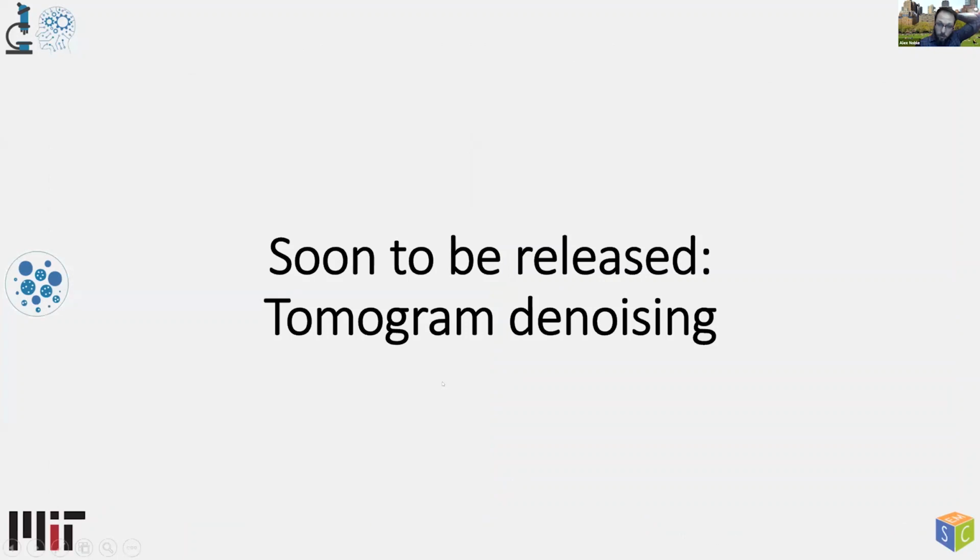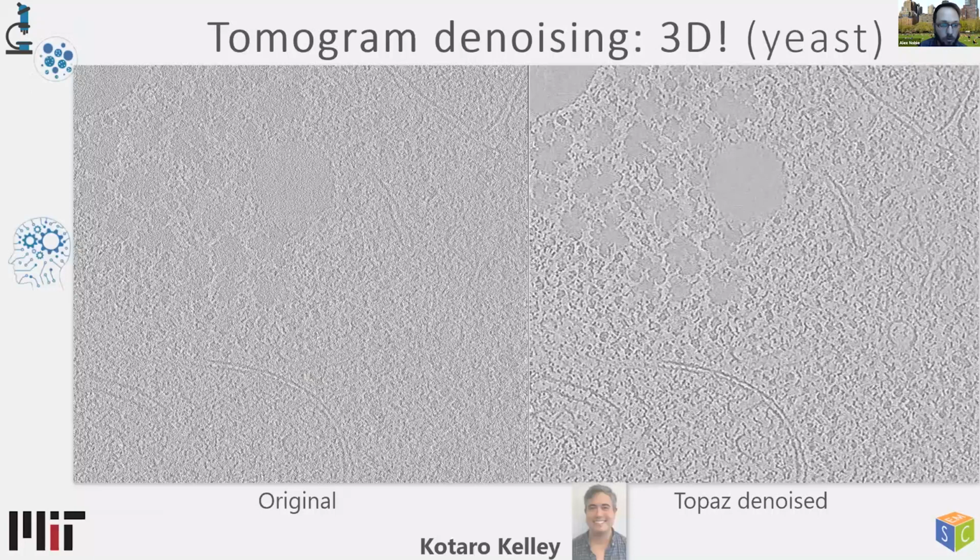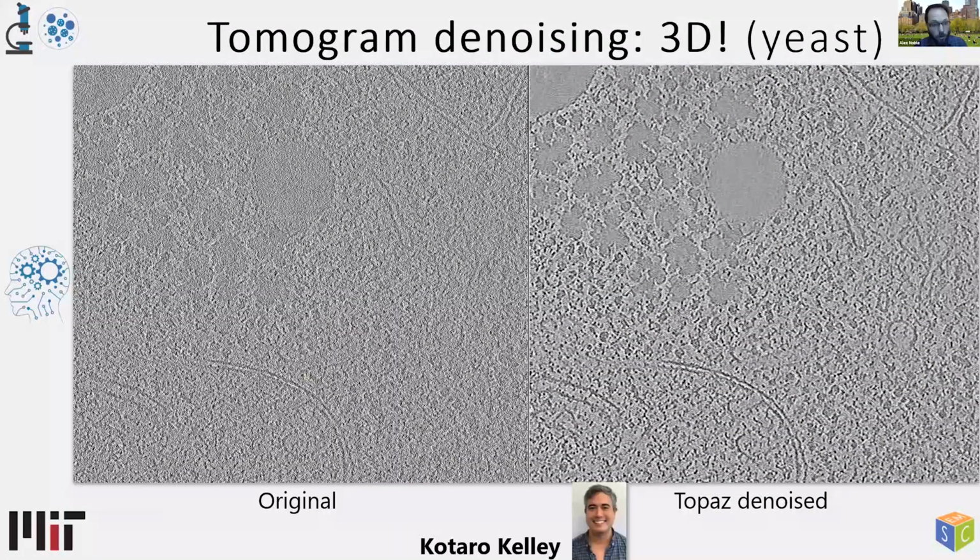Okay, now one of the last things I want to touch on real quick is we have now converted the neural network denoising to 3D, and I'm actually now training about 200 gigabytes of tomograms on 8 GPUs. And so this is one of the results afterwards.